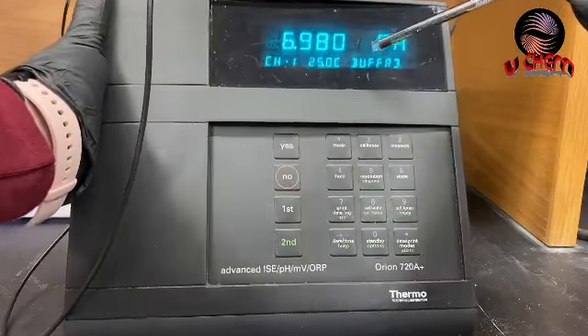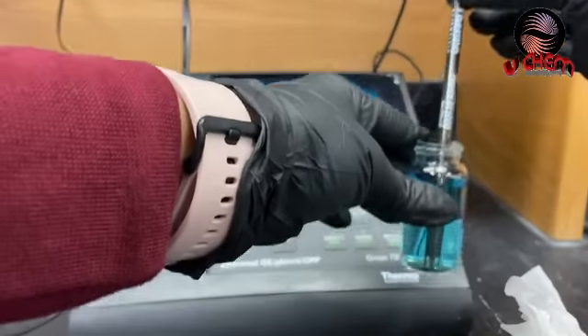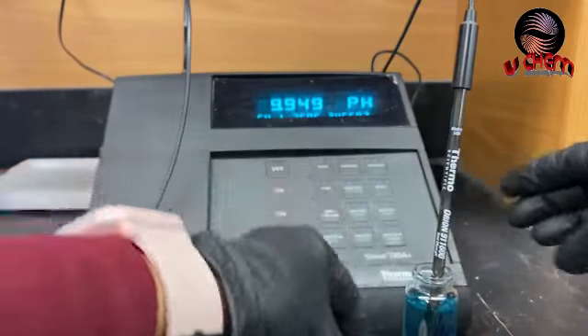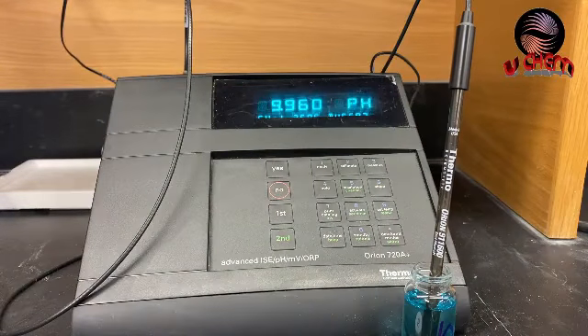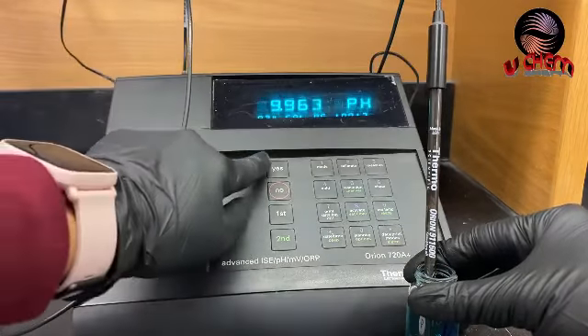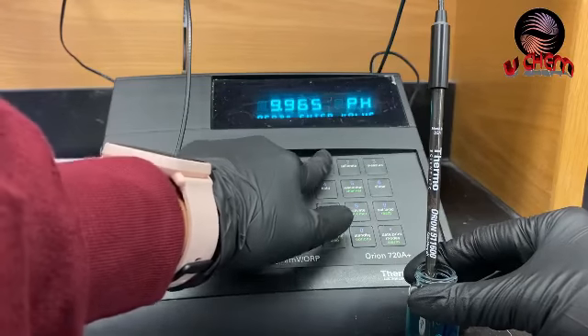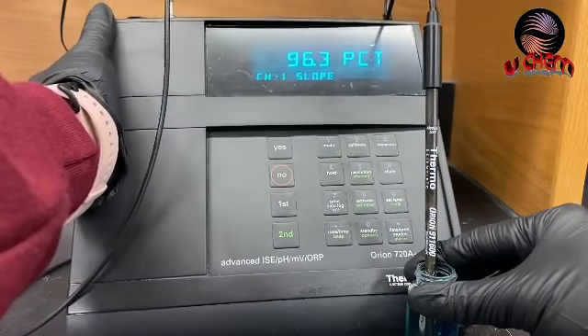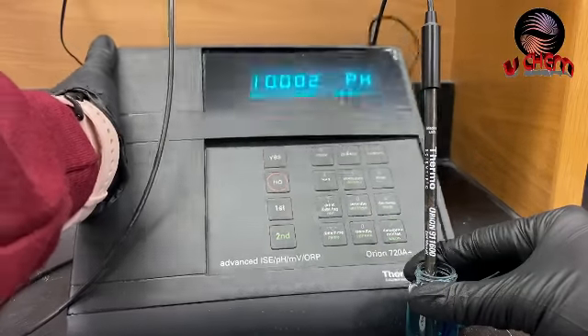The meter says go to buffer three. I've cleaned the probe and placed it into my third buffer, which is pH 10. I'm waiting — it continuously reads and changes numbers until it stabilizes. It says ready, but I'll press no and enter 10 manually, then hit yes. The meter now gives you the slope and prints the calibration result.